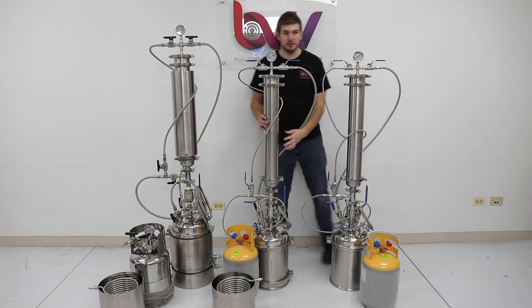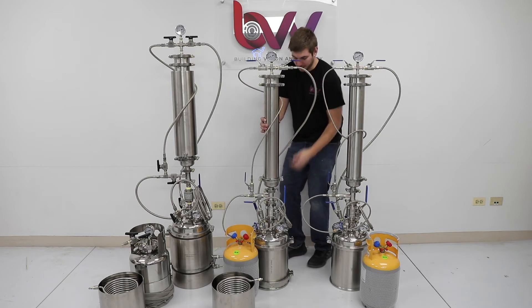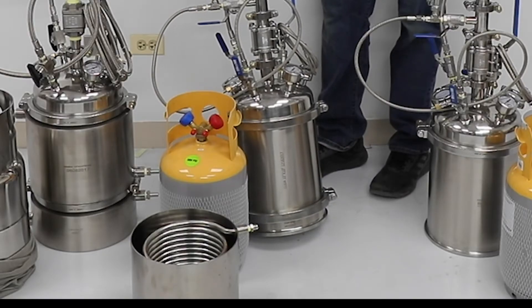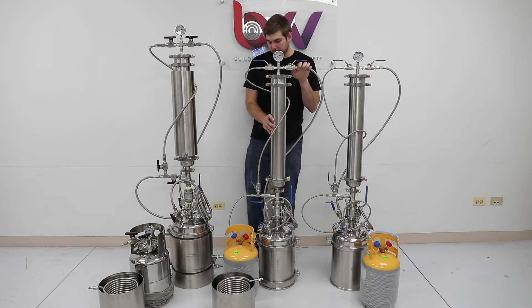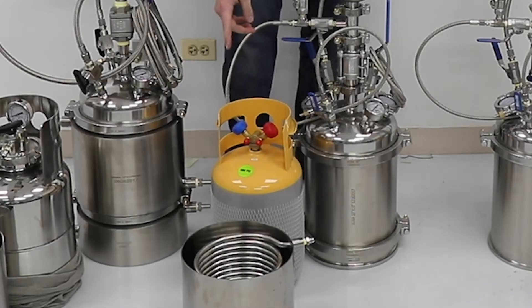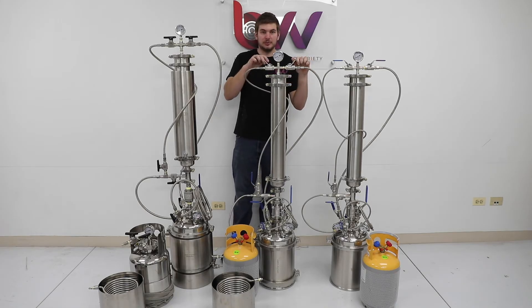Now if we go over to our Professional model, you'll notice a few upgrades. One main upgrade is at the bottom we have a splatter platter, which makes it a lot easier for cleaning out your material at the end of each run. We've also added an injection coil, and we have the same Milwaukee ball valves as the Explorer model.